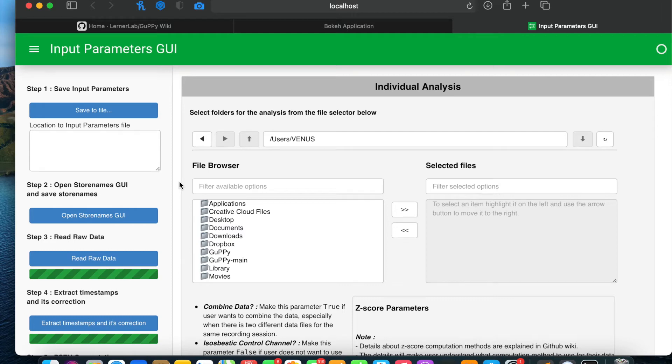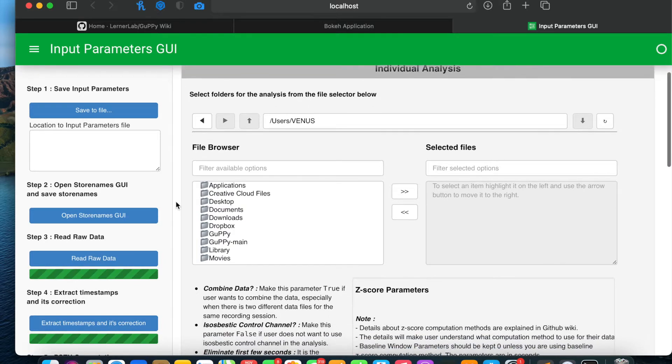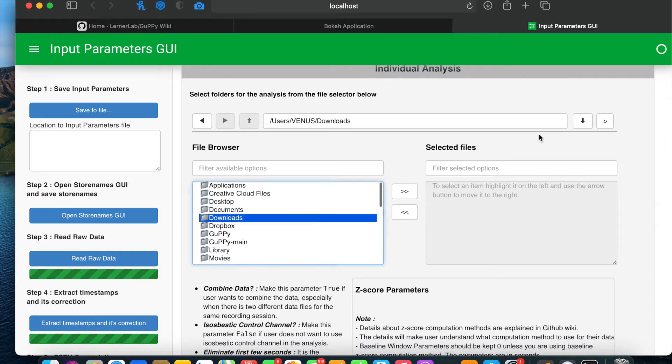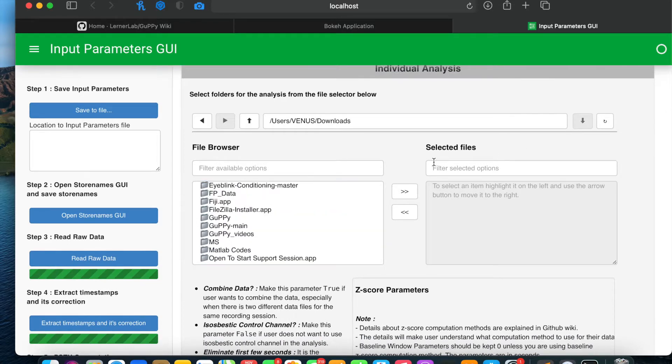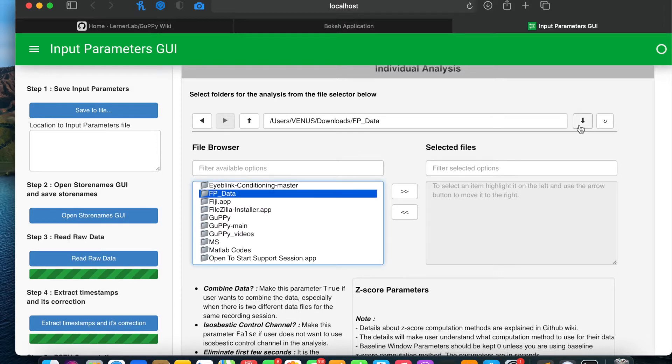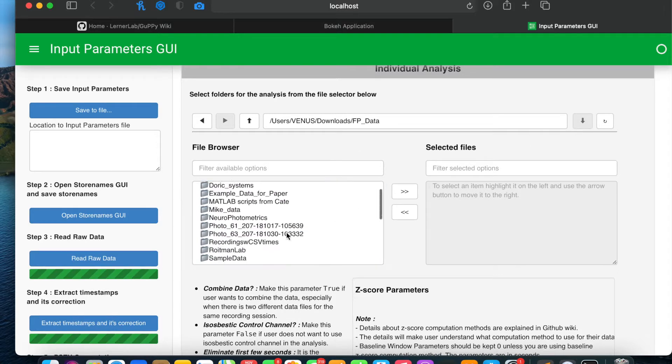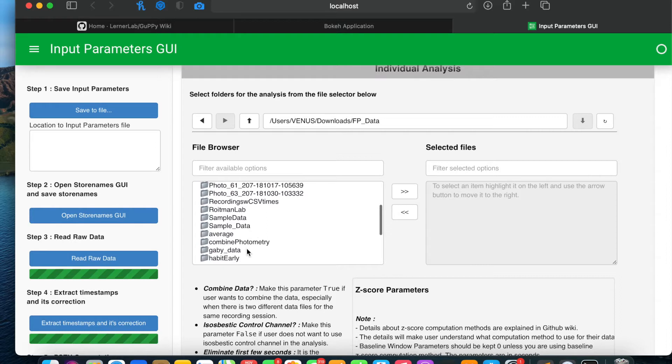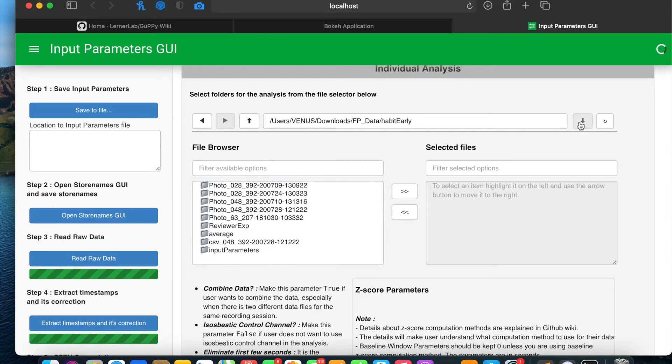In this video I'm going to show you how to do artifacts removal if user has artifacts present in the data. I'm going to first select a data for which I already know there are artifacts in it to show you the whole process.